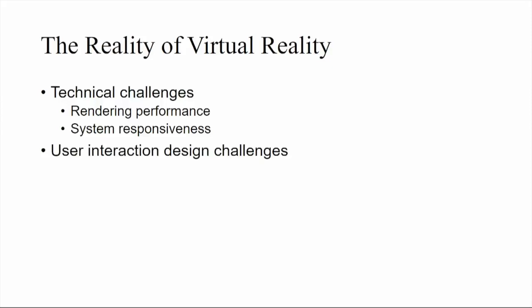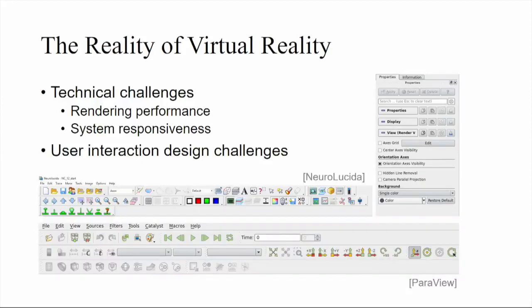Furthermore, user interfaces that we're used to from the desktop environment don't really translate. So if we look at Neurolucida, which is the tool they use, or ParaView, which I'm sure most of us are familiar with, if you imagine trying to work with this in VR, it doesn't translate very well at all.